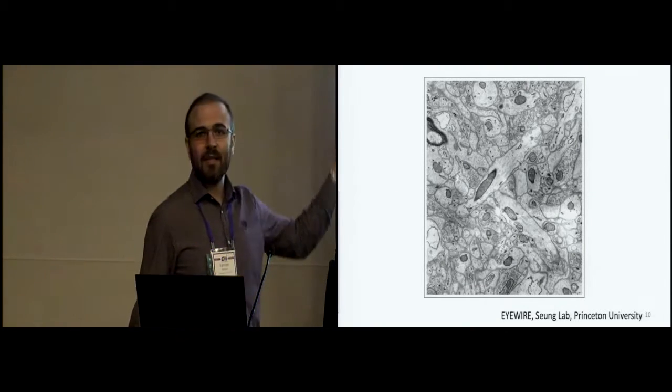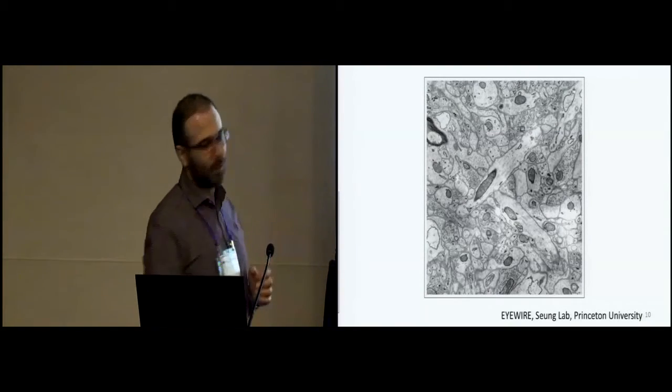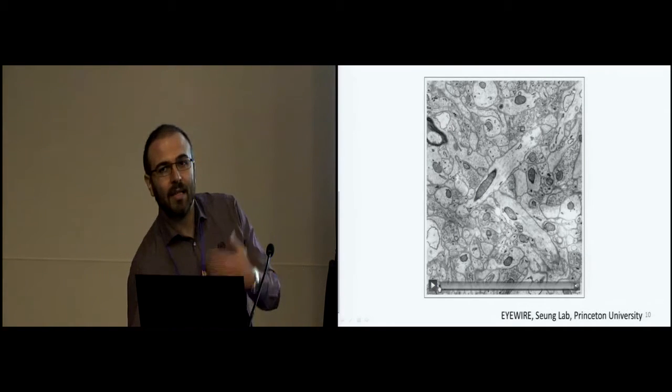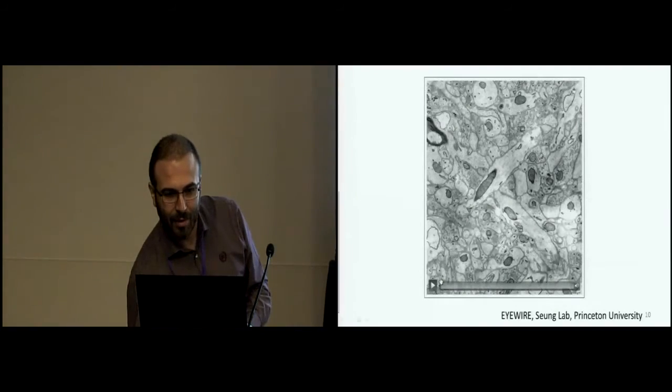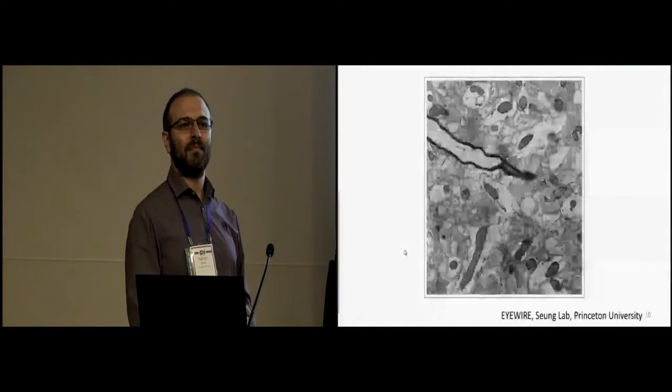Here we have a test data, and I want you to select a particular cross-section, something like this or this, and then just try to follow it as the animation progresses. I'm sorry. I need to, okay.